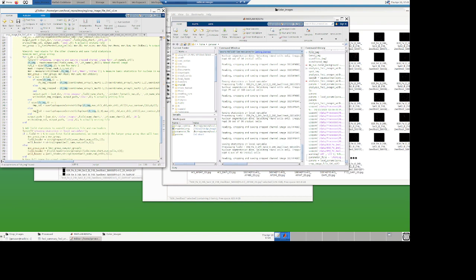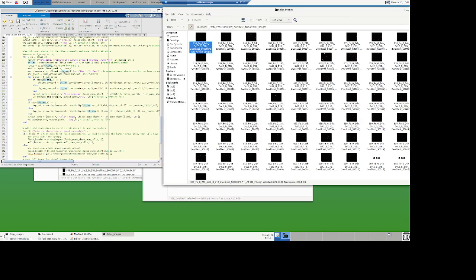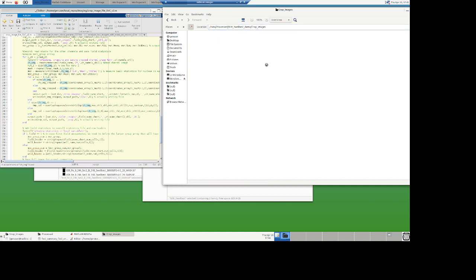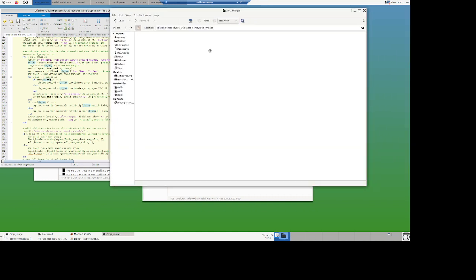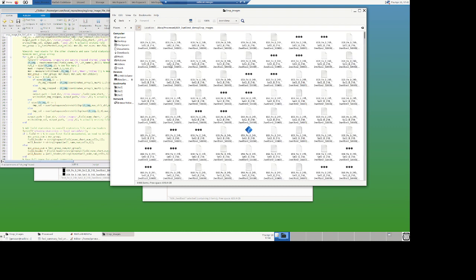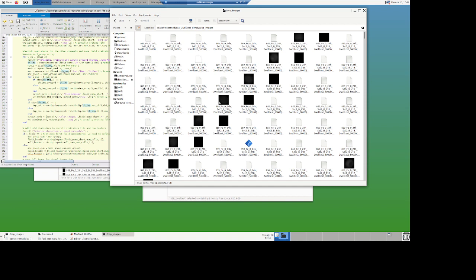And I also save those display images. So those time color images are saved right now, as you can see. And so they are saved into a different directory. So right now I'm saving a couple of things here. The crop images are not here. The crop images are going to be here. And so now I'm generating what we're going to use to do the spot detection, only on the stacks for the ICS. So you see it's pretty big.